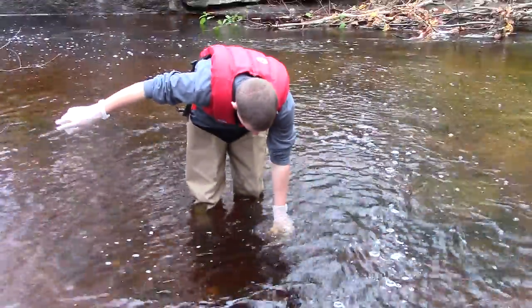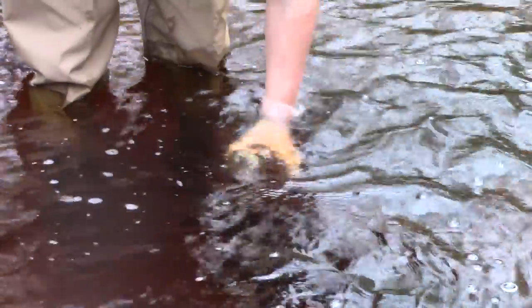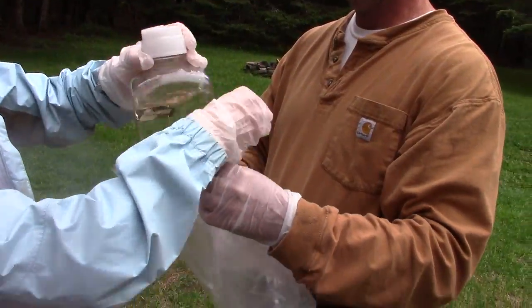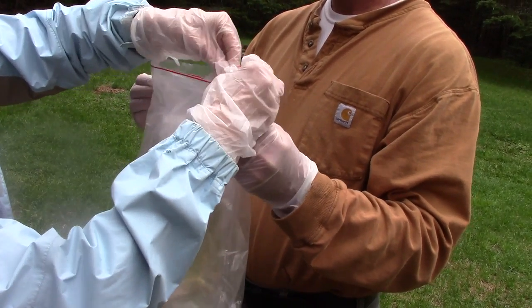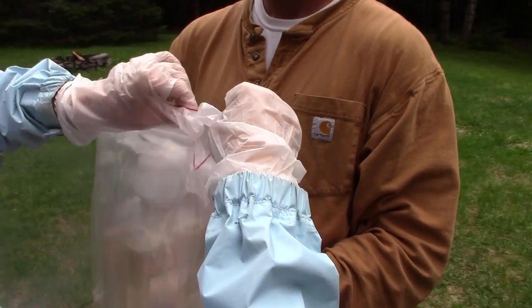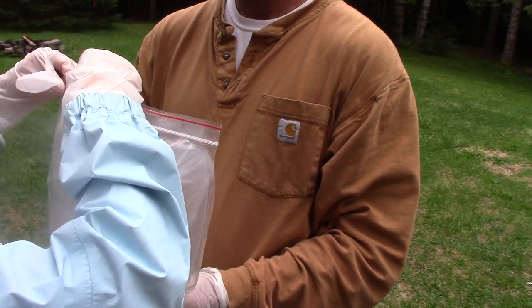Once the bottle is rinsed, Clean Hands then fills the bottle completely and caps the bottle, preferably under water. Clean Hands then returns the full bottle to the inner bag, seals the inner bag, and pushes it inside the outer bag and seals that. Sealing of the outer bag can be done by Clean Hands or Dirty Hands as it signals the completion of collecting this sample.